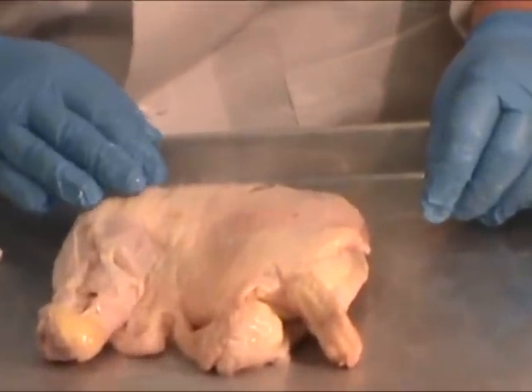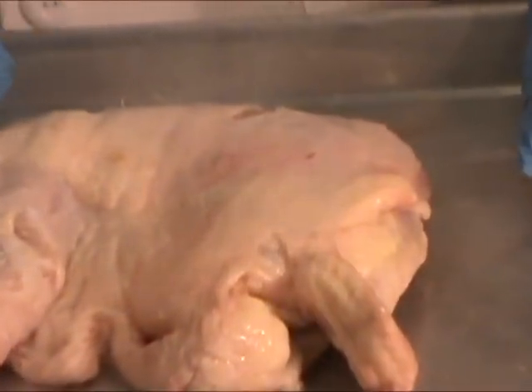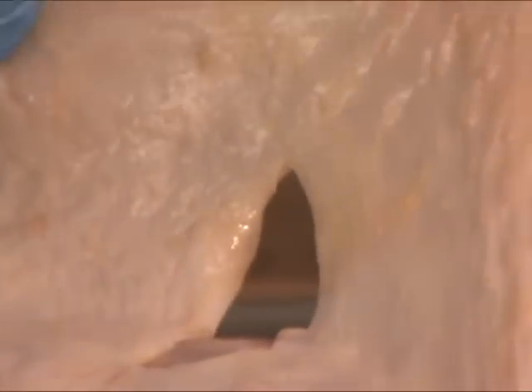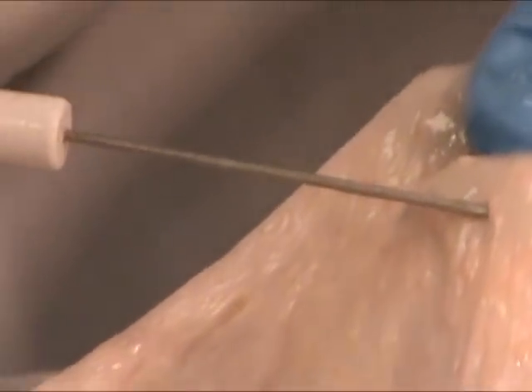The chicken leg is covered with the skin, which is the integumentary system for the chicken. The chicken skin is a little bit different than what you would see with human skin, because chickens have feathers. In the chicken skin, you'll see these little holes, and these holes are where the feathers would be attached to the chicken.